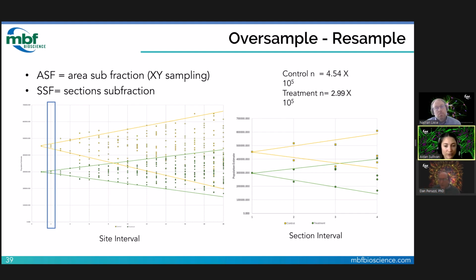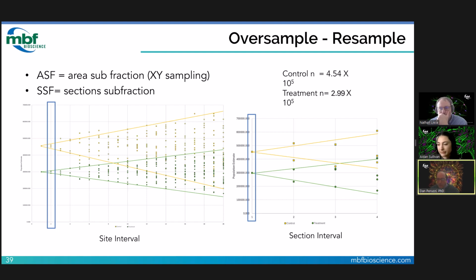Yeah, since I might see more variance on other animals in the study, I really wouldn't feel comfortable decreasing my section interval by a factor of 2. So I think I'll stick to the current section interval that I have chosen. Yeah, 154 sections total, and using just 5 sections, I think would make a lot of people nervous. And looking at that graph, comparing the low estimate from the high mean group and the high estimate from the low mean group, I agree not to slide over to every other section, but keep it with about 10 sections. Okay.